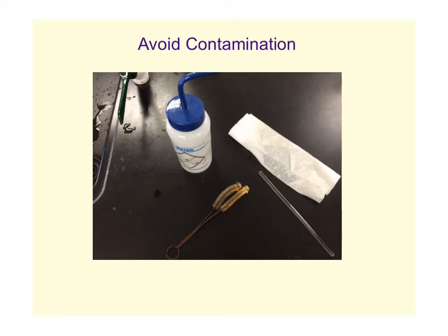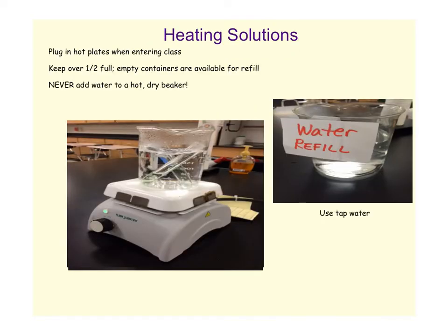So when you stir, you're going to want to make sure that you clean your stir rod every time using DI water. We recommend you wet a paper towel and you wipe that stir rod off after every use to make sure you're not contaminating different test tubes.